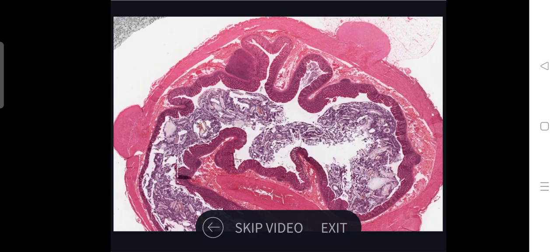This is reduced to a thin layer everywhere except for these three heavy bands known as the taeniae coli. These are easily found, even without magnification, as bulges in this cross-section of the monkey colon. Between them and the inner circular layer of muscle will be the ganglia of the myenteric plexus.